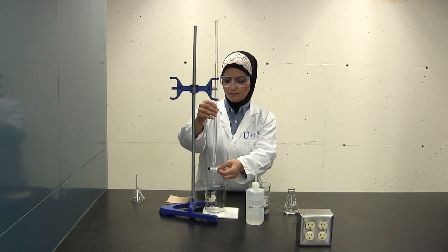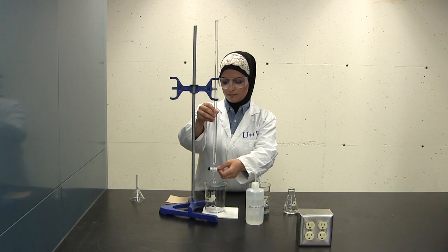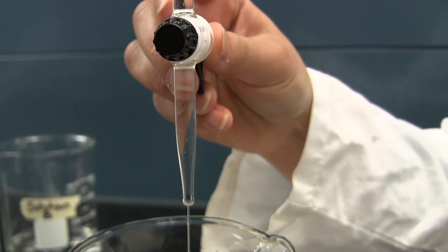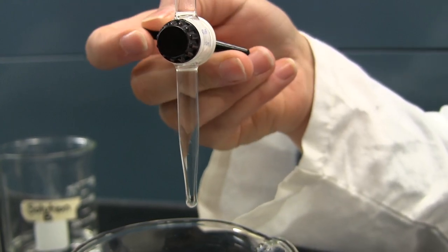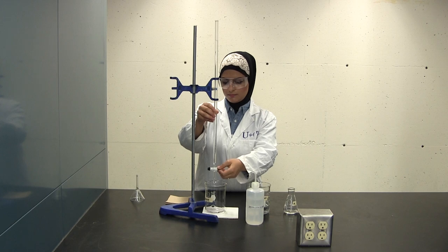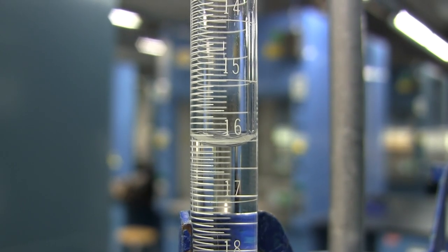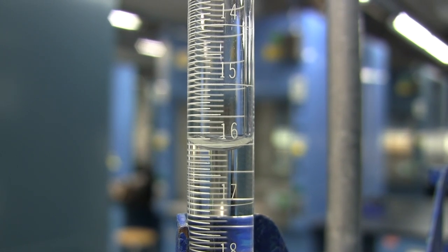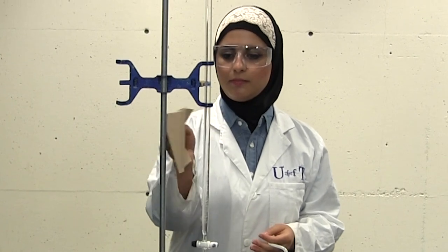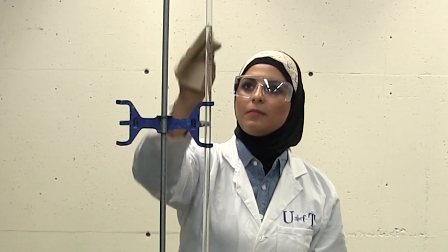Allow the solution to drain until it is within the graduated portion of the barrel, just under the 0.00ml mark. Also ensure that the burette is flowing freely. There is no reason to attempt to start each titration with the solution exactly at 0.00ml — this practice wastes time and chemicals. Touch the beaker to the tip of the burette to remove any hanging drops, and remove any drops adhering to the sides of the tip with a clean tissue.